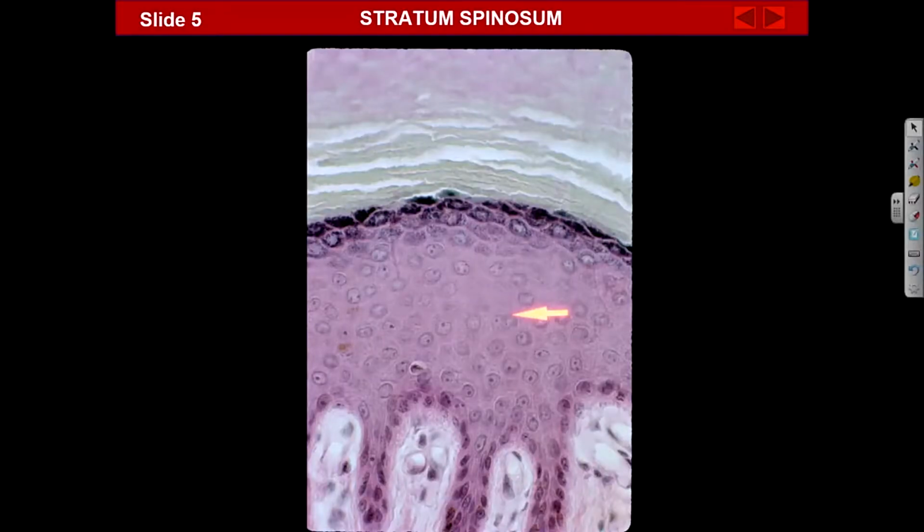Yes? Down here, the stratum basale? Yeah, this is the basal layer going here. The stratum basale is going up and down on the epidermal side of the papillary layer of the dermis. So this is the papillary layer, the finger-like interdigitations of the dermis, right? So on top of the papillary layer in the epidermis is the stratum basale, like here. Okay, any other questions?